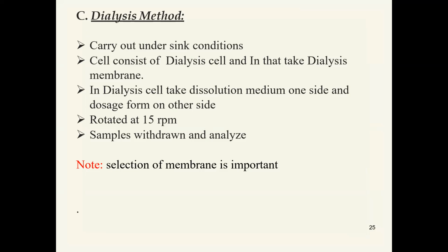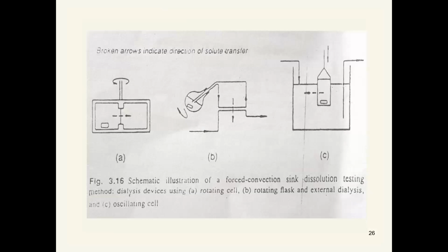The use of this dialysis method is that here we are using a dialysis membrane. The dialysis membrane is used to maintain solute concentration without disturbing the dissolution process. This method is useful, or makes it possible, to carry out dissolution studies under sink conditions.